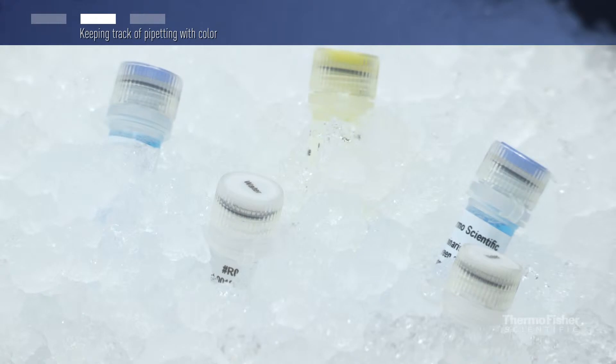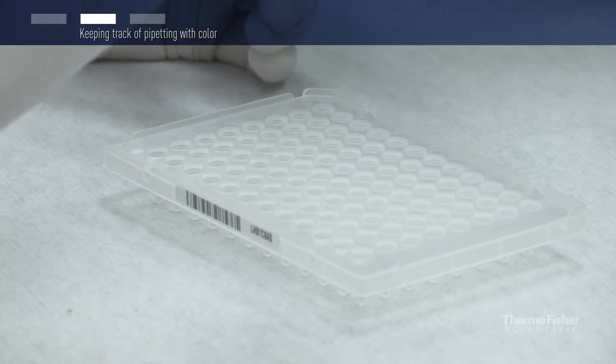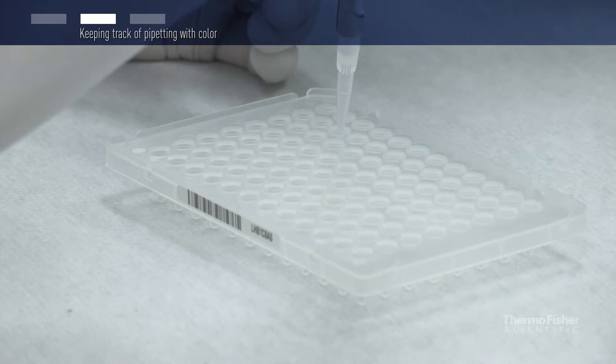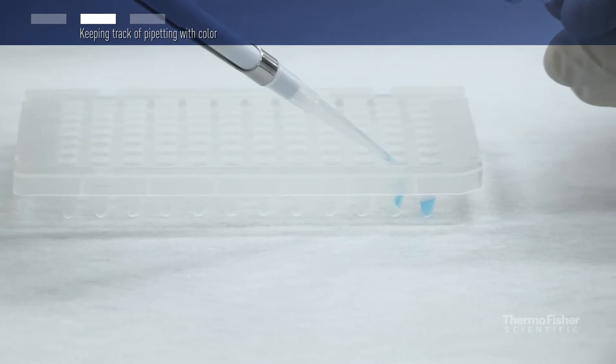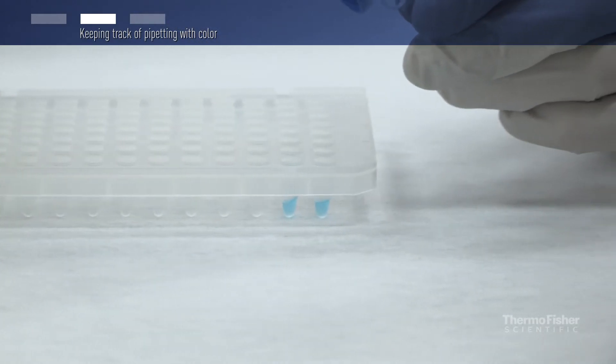Luminaris qPCR mastermix is colored with an inert blue dye. The blue color helps keep track of the pipetting of the mastermix into the reaction wells. It is easy to monitor which wells in the PCR plate are empty and which ones already contain the qPCR mastermix.